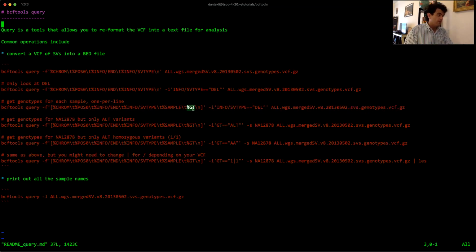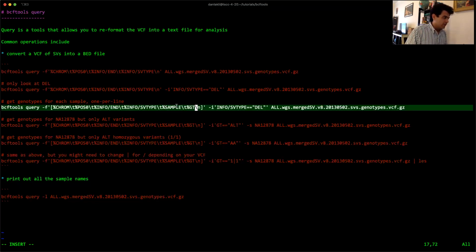And then you can also mix different delimiters, right? They don't necessarily have to be just tabs. I mean, I like tabs, but say for example, you want the last column to be a mix of commas and tabs, or maybe you want to use a colon here, right? Or maybe you just want to say something like, hi, it'll work. Why not? I won't save it here, but yeah, let's look at this one.